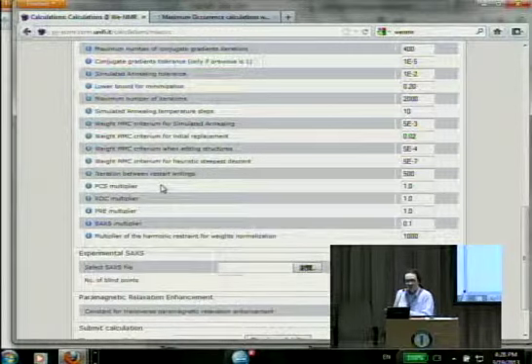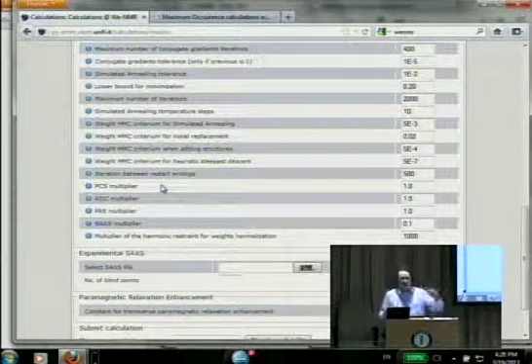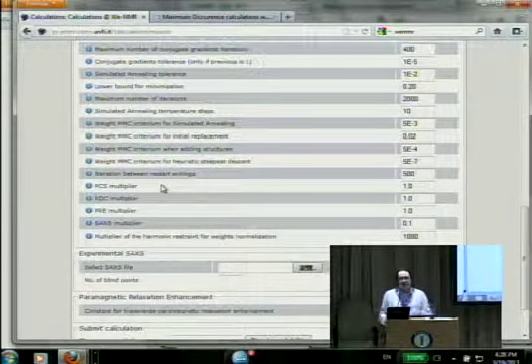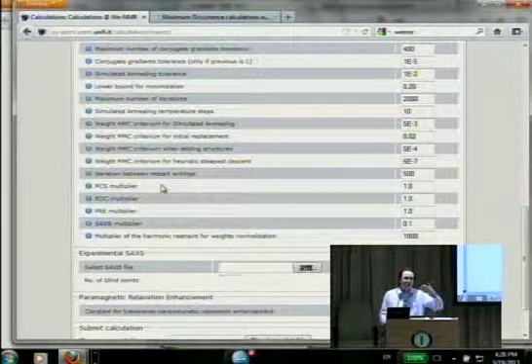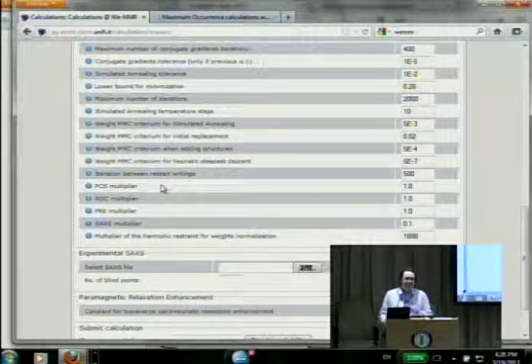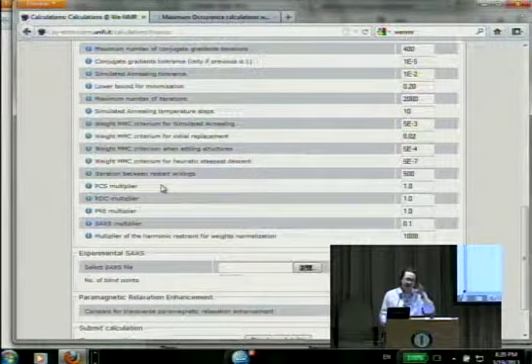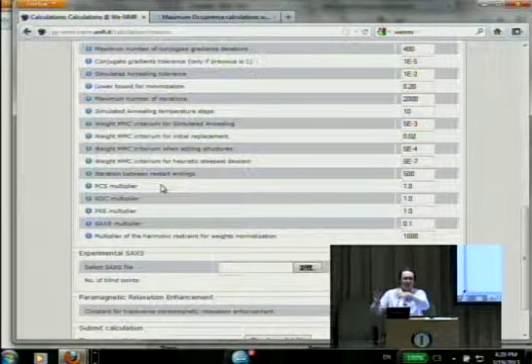So say you want to get a target function that's around 0.3 or 0.5, you know that pseudocontact shifts are contributing 0.1, and residual dipolar couplings are contributing, I don't know, 10. You set the multiplier for residual dipolar couplings to 0.0 something, and maybe you can have even 2 for the pseudocontacts.